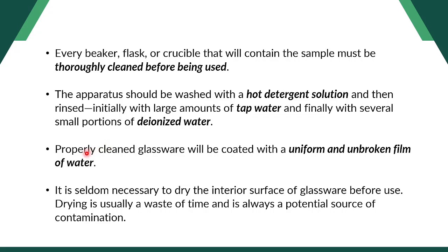And then, we also have here: properly cleaned glassware will be coated with a uniform and unbroken film of water. So, mailhan nato nga ang isa ka glassware kay properly cleaned siya if inig paagas nimo og deionized water, ang pag-encapsulate ana niya sa mga glasswares kay uniform and unbroken. In other words, water sheeting. We call this one as water sheeting.